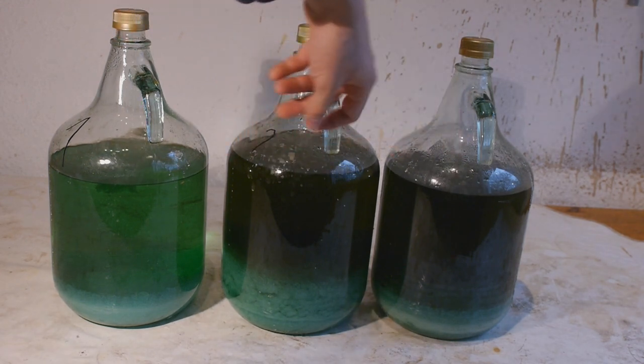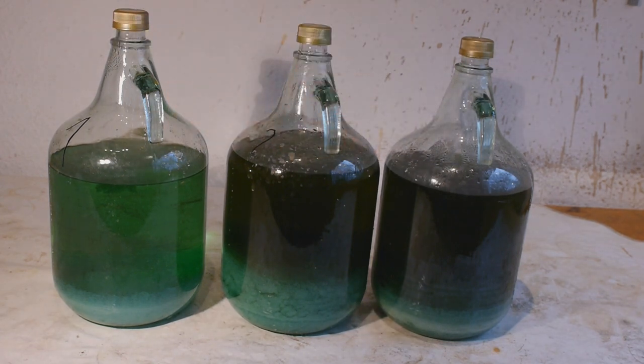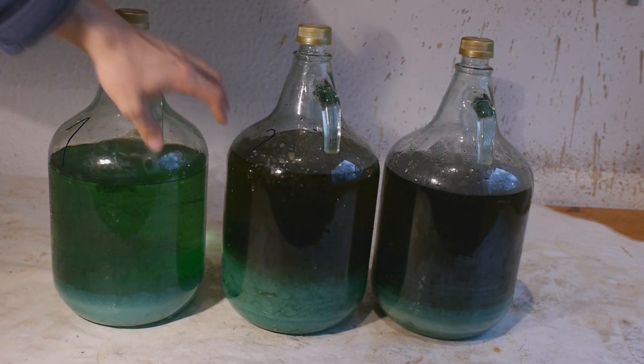These two might look like they're not really clean, but the reason the solution above there is so black is because a lot of the iron 2+ has oxidized to iron 3+. And that's what's causing the dark color. This isn't actually an impurity that we have to worry about.